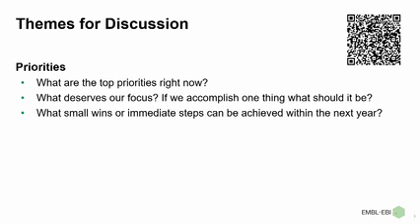But in many metabolomics datasets, there is another dimension of chromatography. Are we also considering standardizing reporting of gradients, solvents, columns, making that even mandatory when uploading our data? And the second question, building up on this, could we even envision introducing retention time standards more broadly?